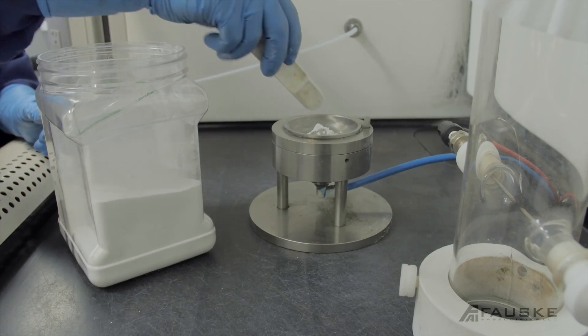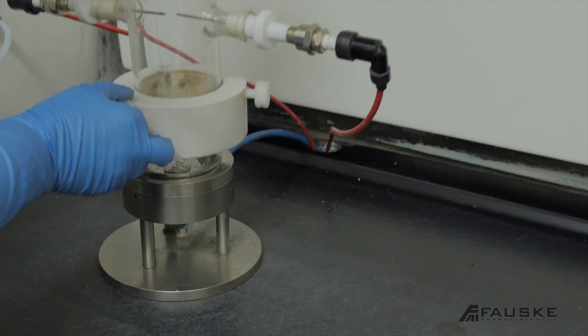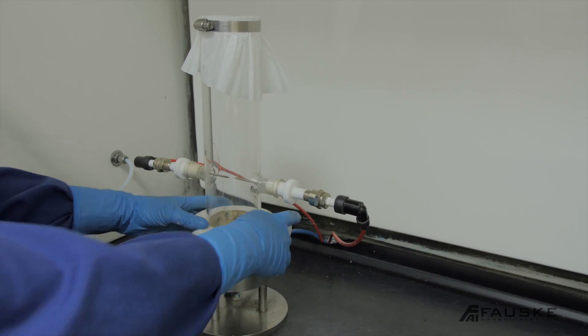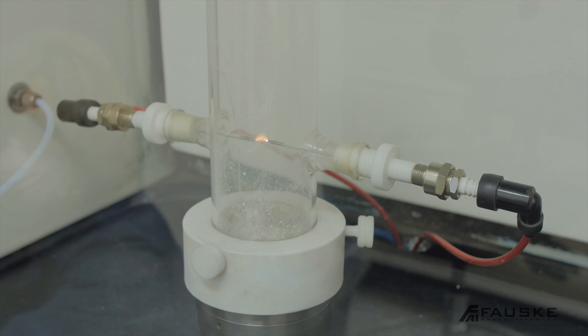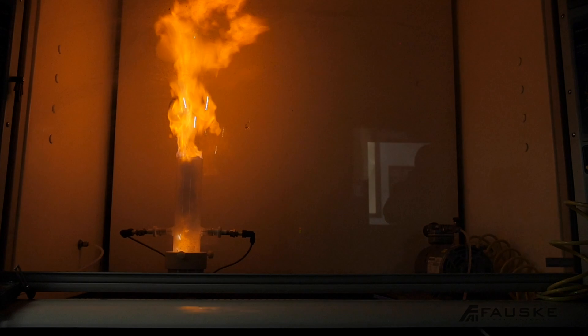Now that our sample is prepped, we can go into the testing lab and see if it explodes. The first step is to determine if the material is explosible, which is also known as a go/no-go test. Our initial testing starts with the modified Hartman tube. This will expose the material to a 10 joule constant arc ignition. If the material is explosible here, it most likely will explode in the 20 liter chamber. A go-result allows us to immediately move the material to the section of the lab that can tell us under what conditions the material will react.